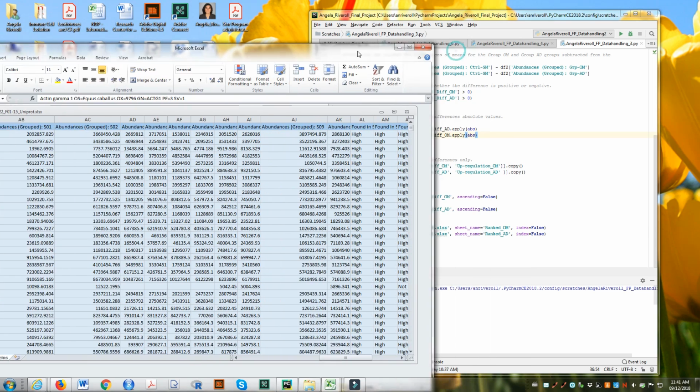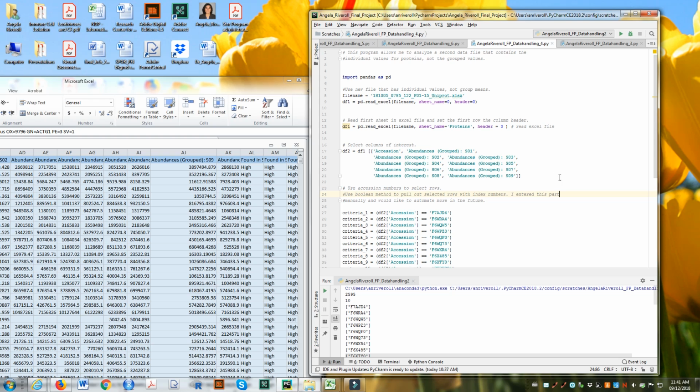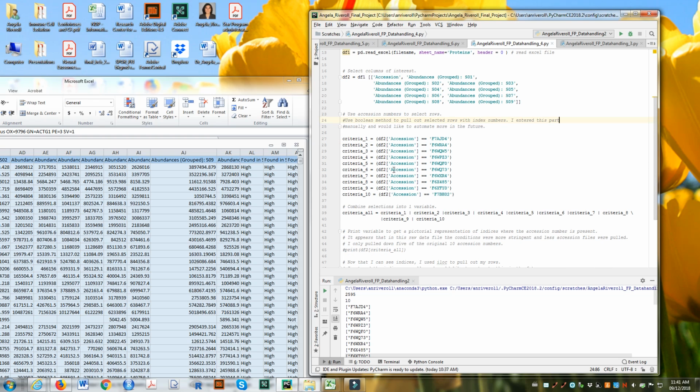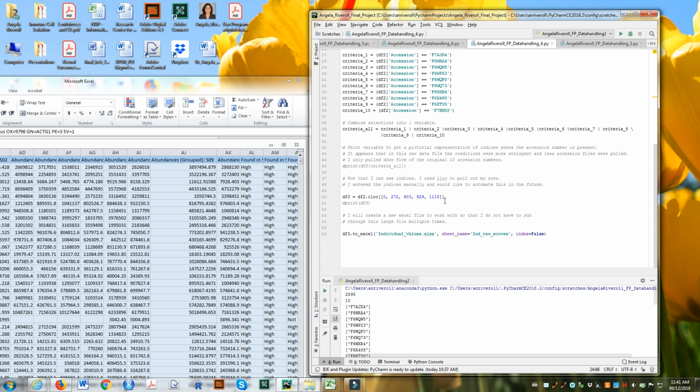So that brings us to the other data handling software, where I could recycle some of the code I'd originally written. Same thing using pandas: opening the file name, reading it, picking out the columns I cared about, getting the IDs and pulling them out.